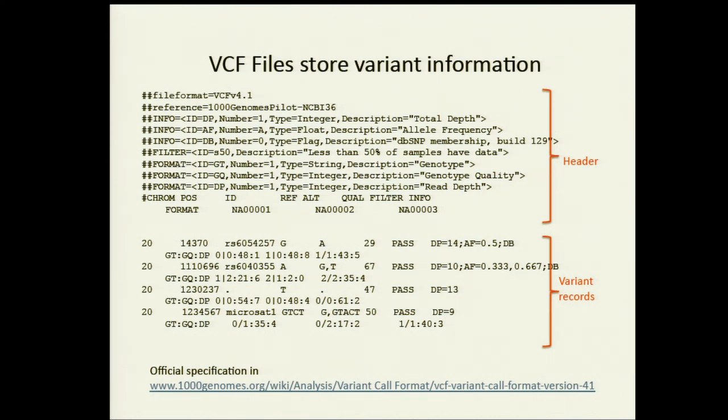So I saw the 0 for the second sample. 2, 1, 2, 0. I don't know, genotype call. Whoever put this particular example in chose poorly for the depth. I think they were just putting numbers in to make it an example. So it's a good question. We should probably put in a real-life one. It was hard enough to get this formatted right. I should update those numbers. It's a good point. Thank you.